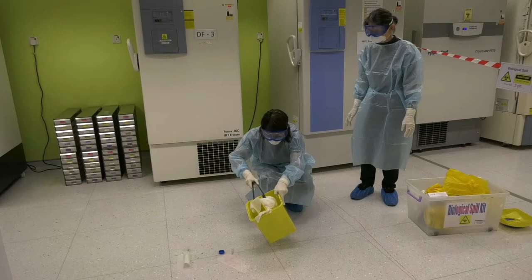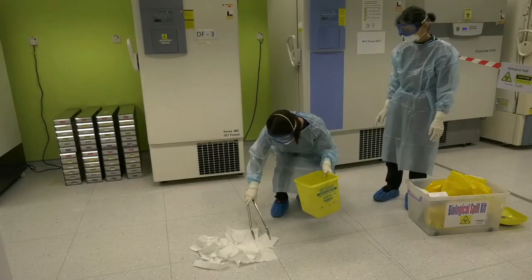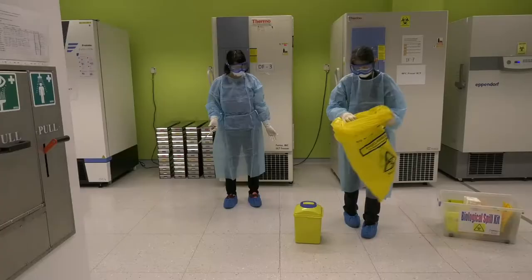Pick up sharps and dispose into a sharps bin using tongs. Wipe the area and discard absorbent material waste. Repeat the disinfection procedure again. Finally, clean up with water. Close tightly the sharps bin and dispose it in a double biohazard bag.